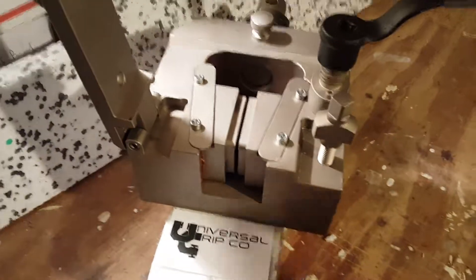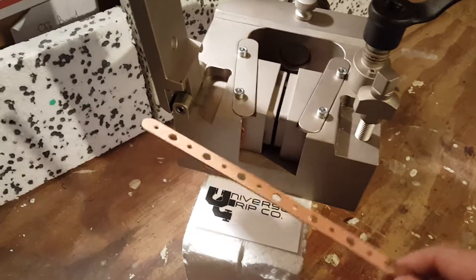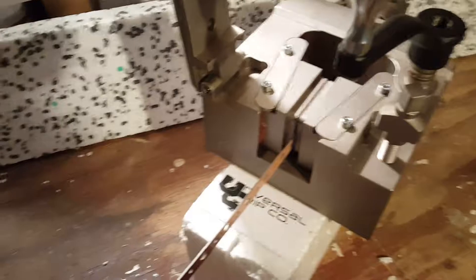This wedge grip is great for any softer metal samples such as brass, copper, or aluminum. I'm going to put it into our grip here. This can be outfitted with different grip jaws, depending on if it's a flat sample or a tubular or cylindrical sample.